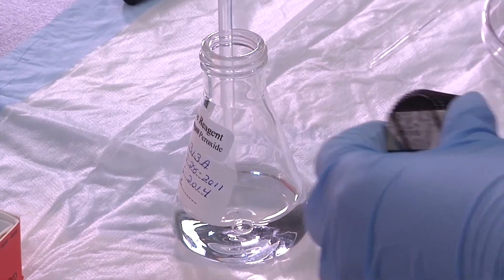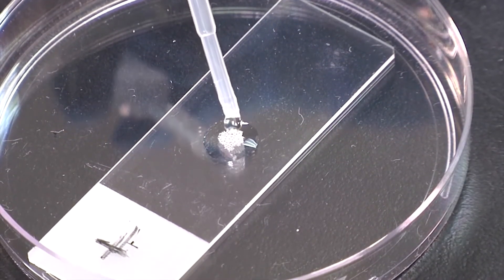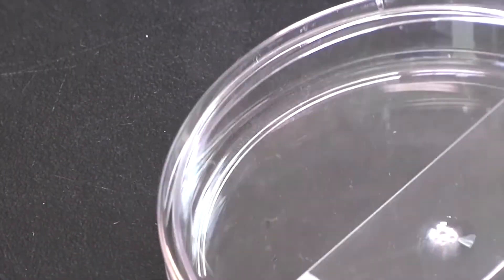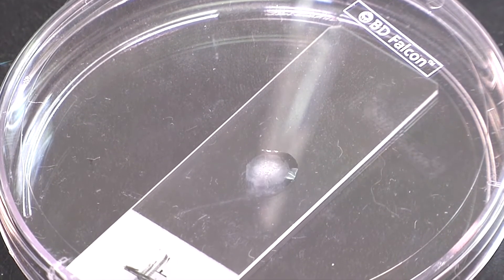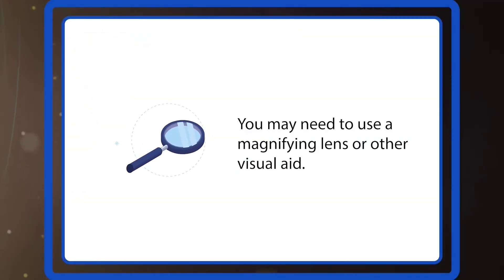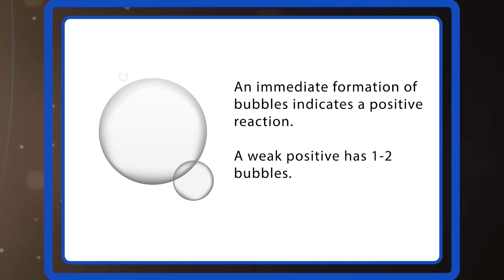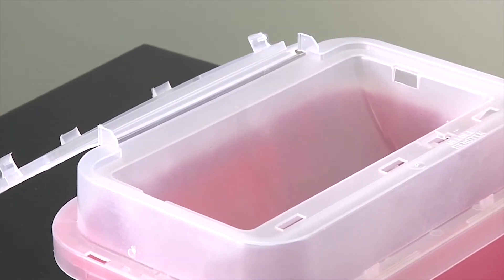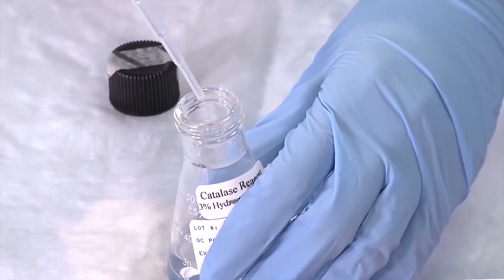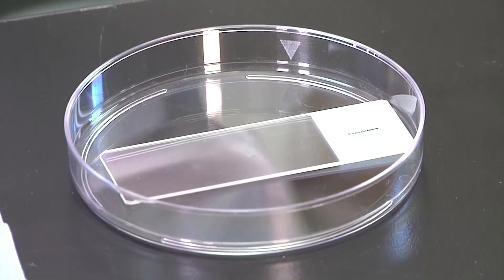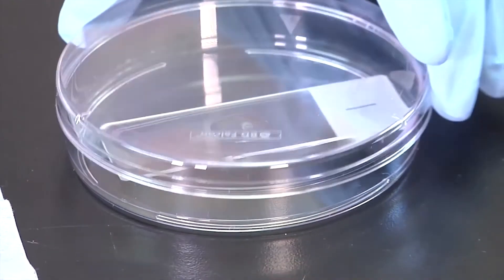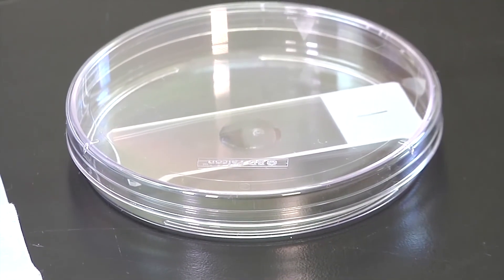Next, using a dropper, add one or two drops of H2O2 solution to the smeared colony on the positive control slide and immediately place the cover onto the petri dish. Against your bench top or a dark background, look for the formation of bubbles immediately upon the addition of the H2O2. You may need to use a magnifying lens or other visual aid. An immediate formation of bubbles indicates a positive reaction; a weak positive has one to two bubbles. Discard your pipette into a biohazardous waste container. Then test the negative control slide: add one drop of H2O2 solution to the smeared colony on the negative control slide and close the petri dish. No formation of bubbles within 20 seconds indicates a negative reaction.